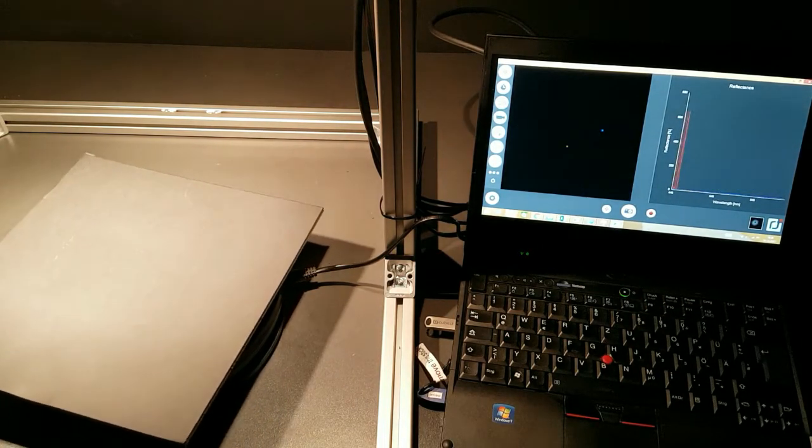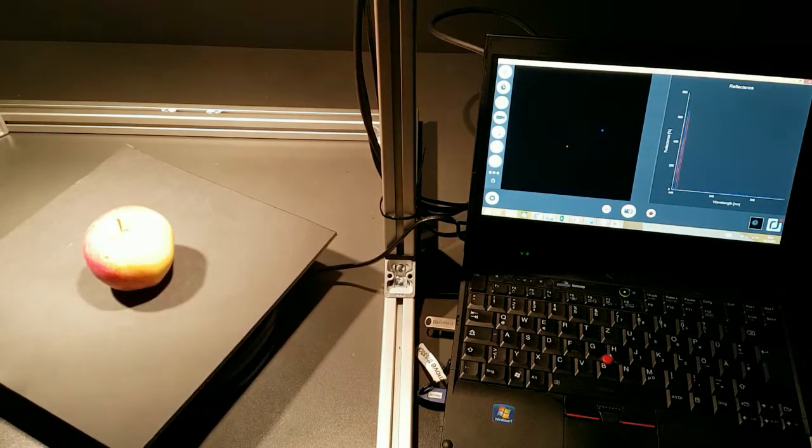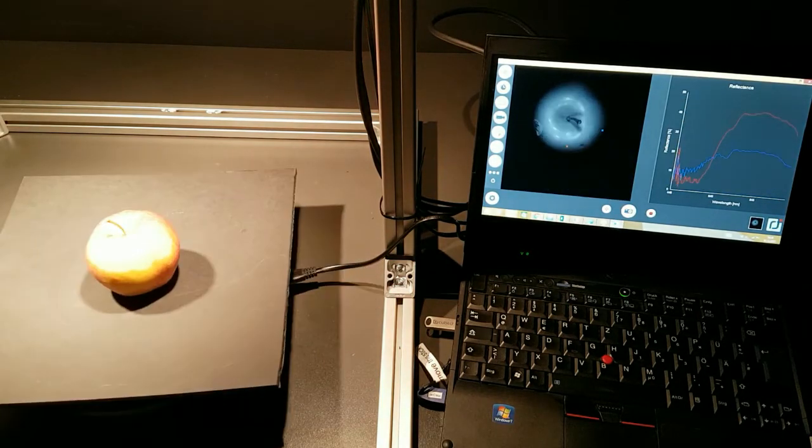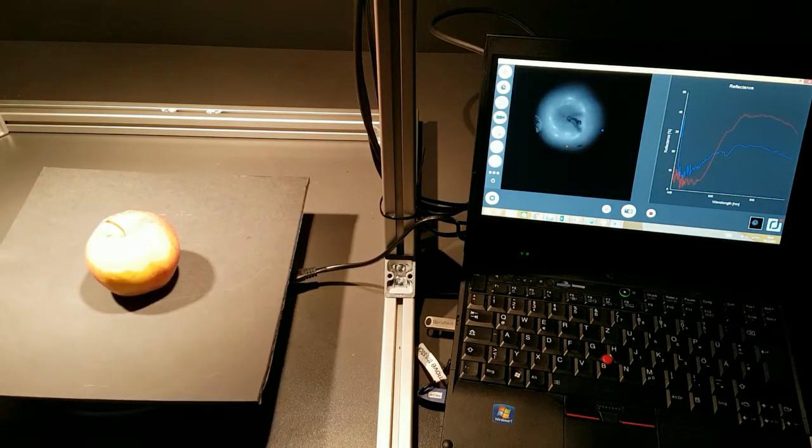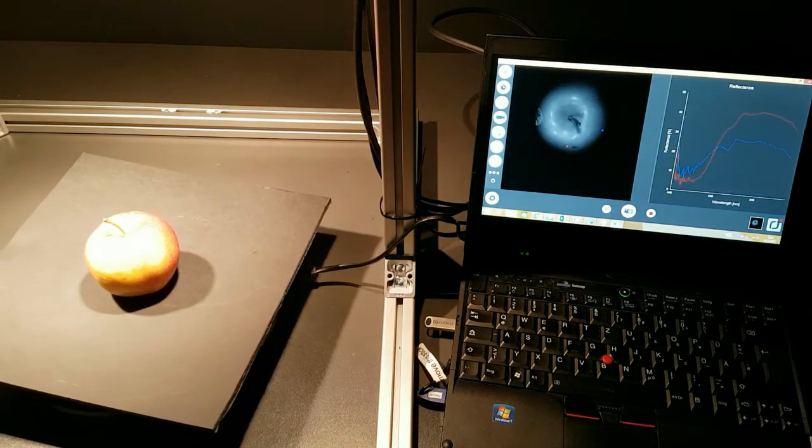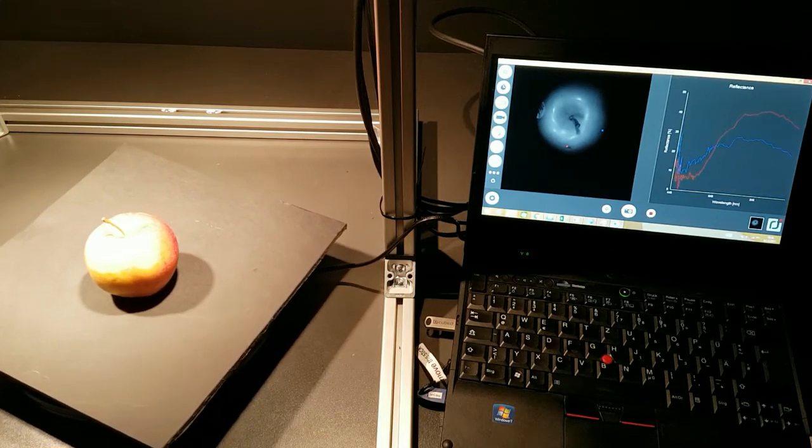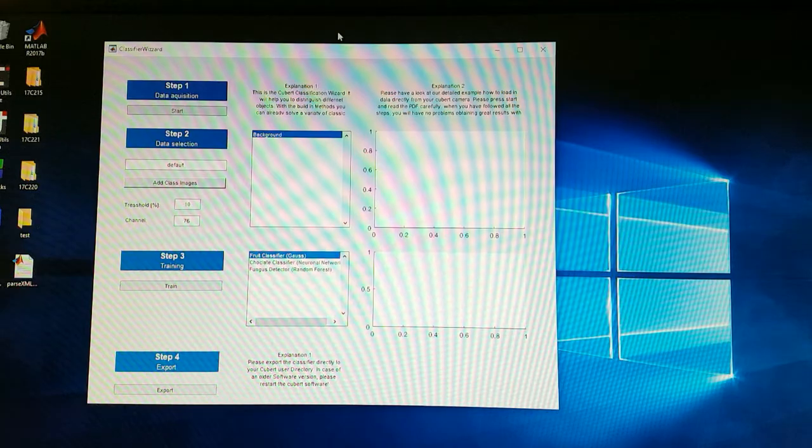Then you switch to the other apple. It will now distinguish how is the spectral response of that apple.